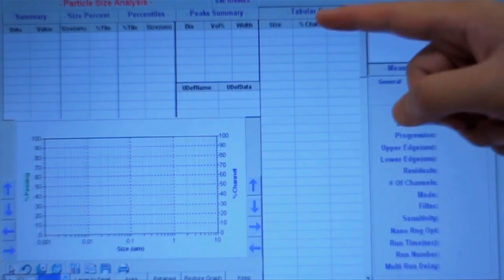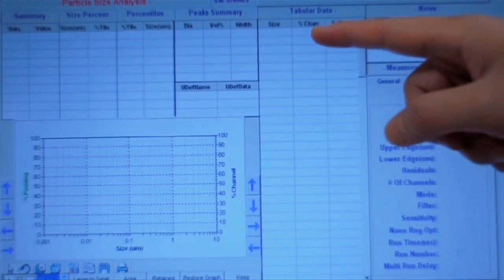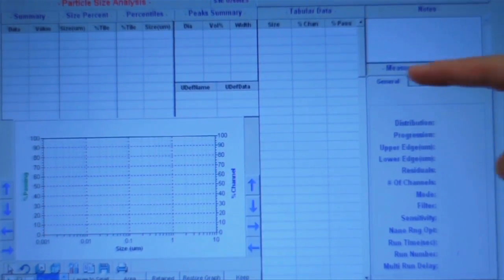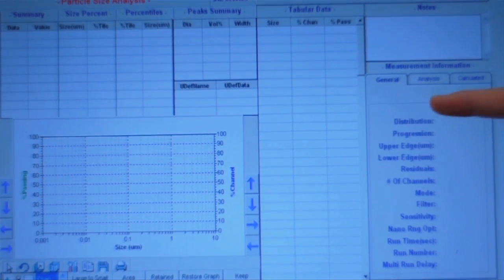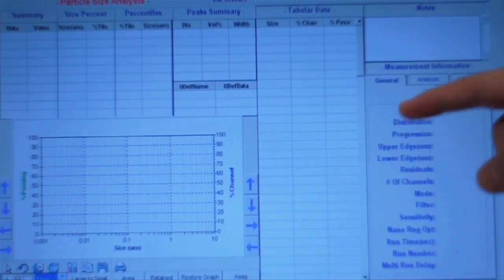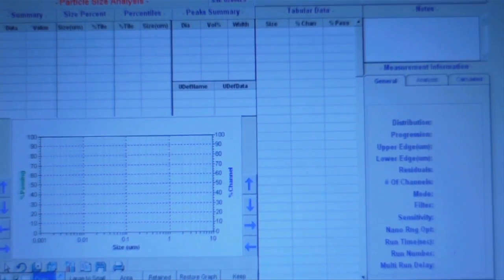If you are interested, the tabulated data column lists the raw data detected. You can enter some notes about the samples. It also displays some information on the analyzer such as size range available and serial numbers.